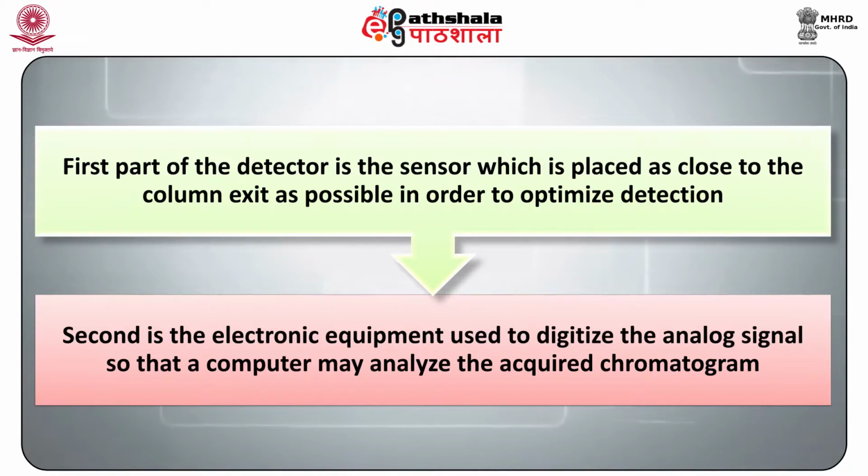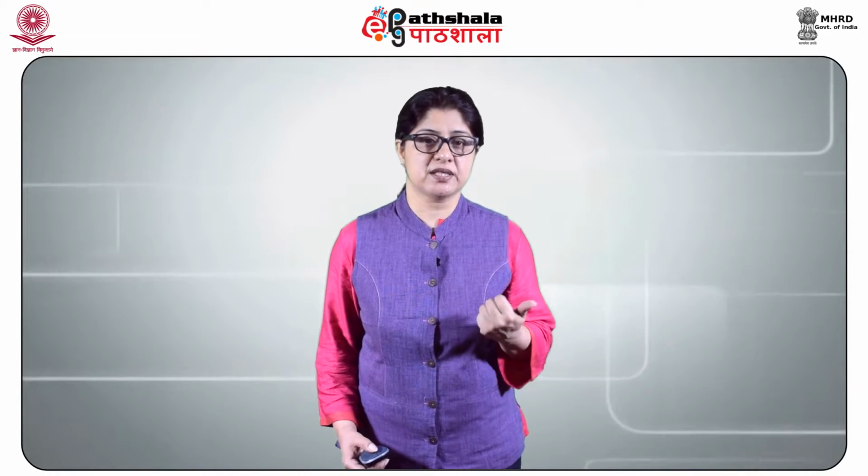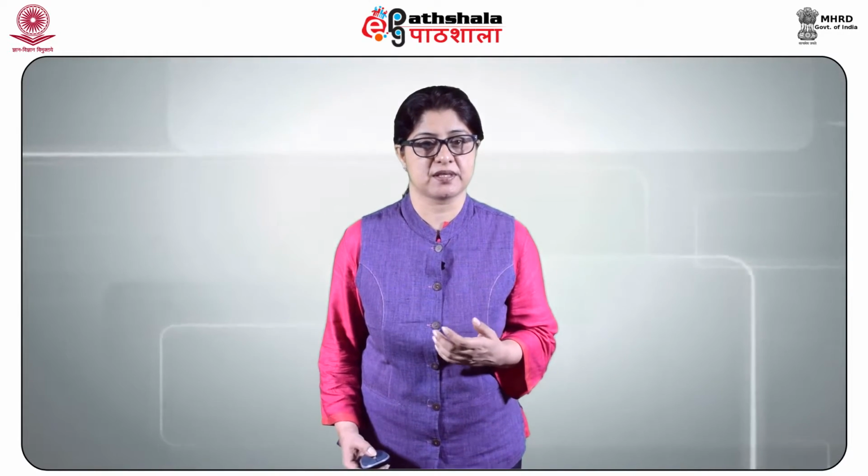The second is the electronic equipment used to digitize the analog signals so that the computer may analyze the acquired chromatogram. The sooner the analog signal is converted into a digital signal, the greater signal to noise ratio becomes, as analog signals are easily susceptible to many types of interferences.